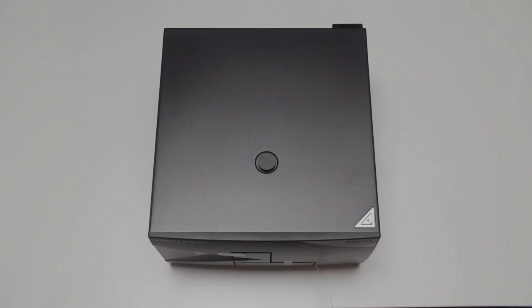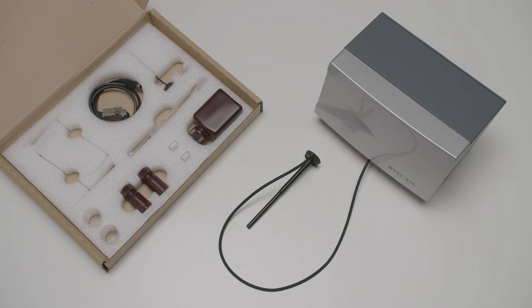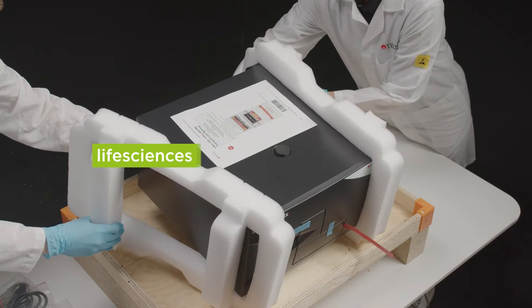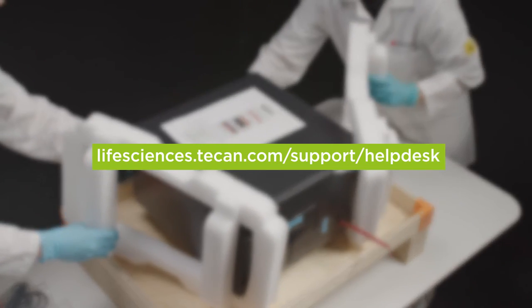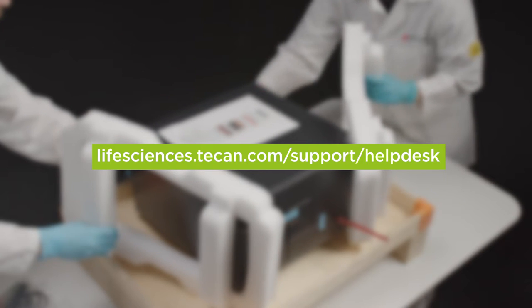Depending on your order, the injector module comes in a separate box. If you think anything is damaged, please refer to our help desk.